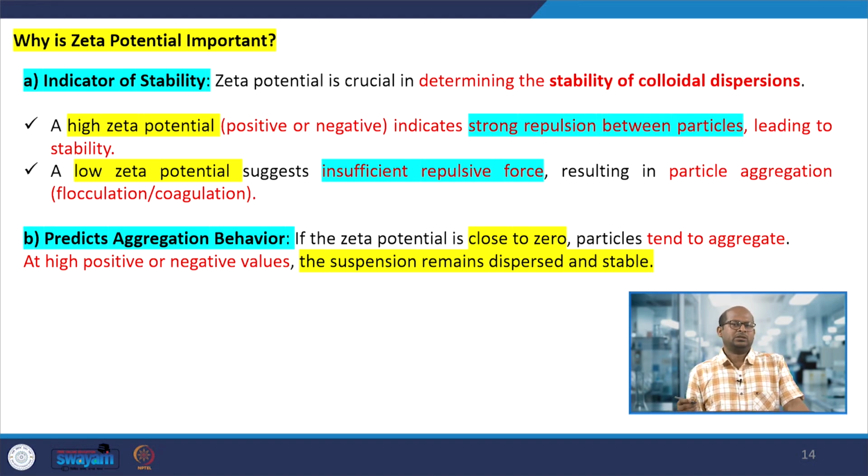If they are not properly dispersed and the nanomaterials coagulate, form large particles and deposit, then the property would be changed or affected with time.